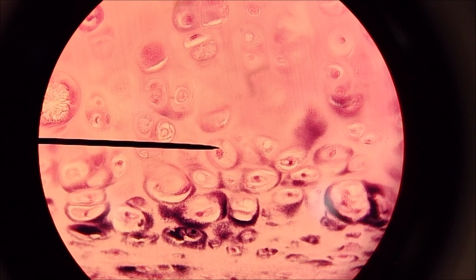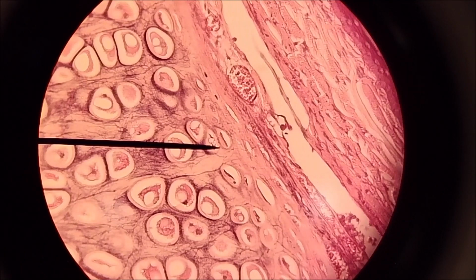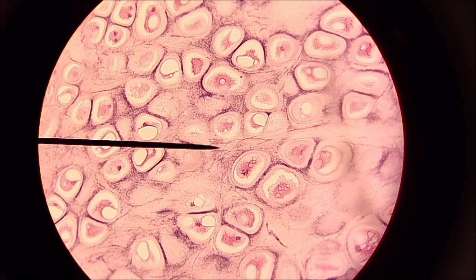All right, if that's hyaline cartilage, compare it to, let's see if we can find elastic cartilage. There's some elastic cartilage. Right in there, looks like a winner. All right, that is elastic cartilage. So they look similar, they certainly look similar. But you can see this webby background here, like that, and right in there. That is very, very indicative of this elastic cartilage.